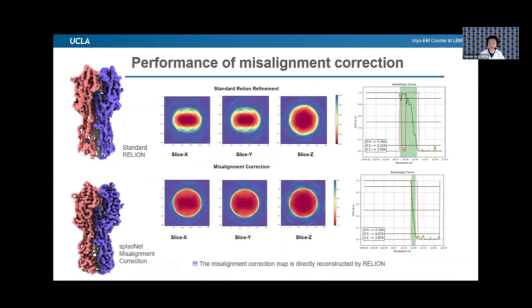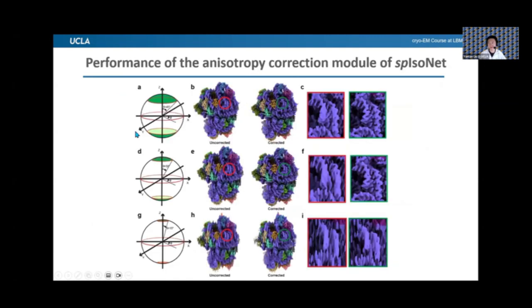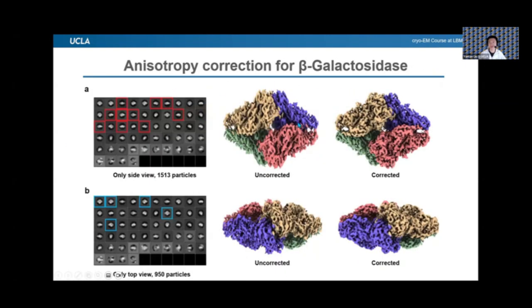The reference map is typically not necessary if your refined structure is roughly the correct shape. For example, here you don't typically need it. From here you don't need it because the shape is kind of correct.